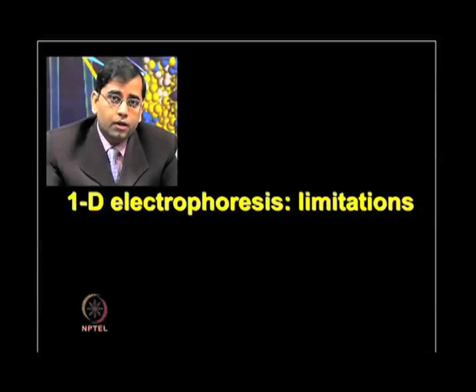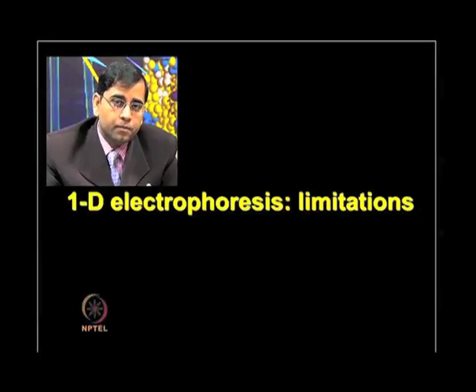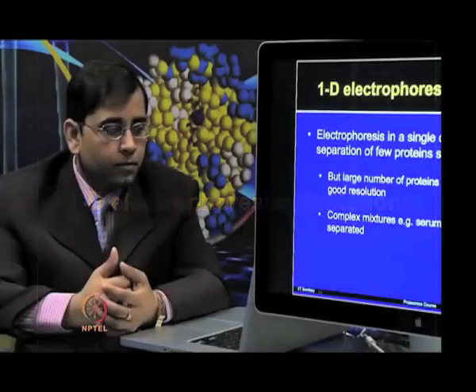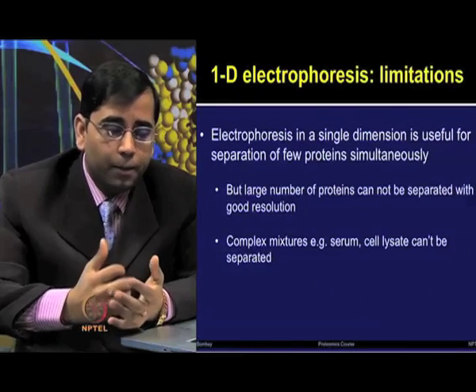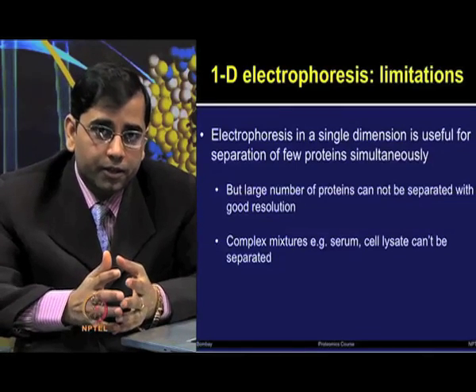However, one-dimensional electrophoresis has different limitations. You cannot separate your complex proteome, the complex protein samples. If you have thousands of proteins and you want to study them, then one-dimensional electrophoresis has limitations. So one-dimensional electrophoresis is useful to separate a few proteins or a simple protein mixture.